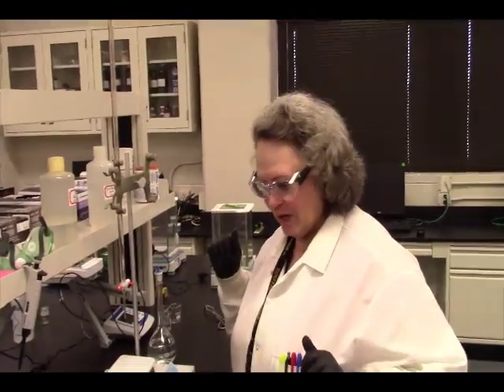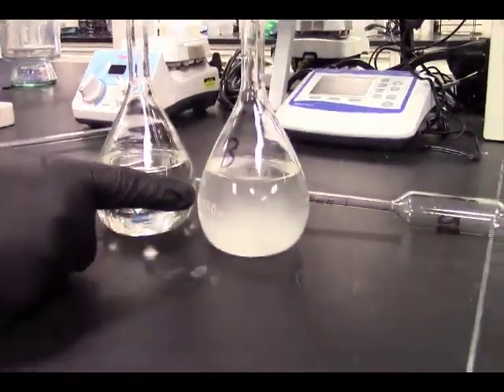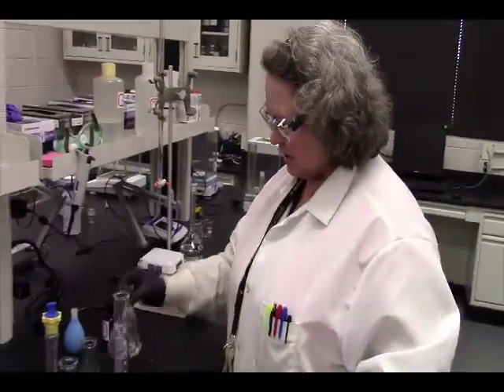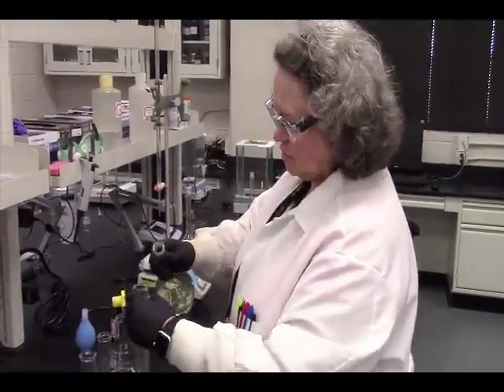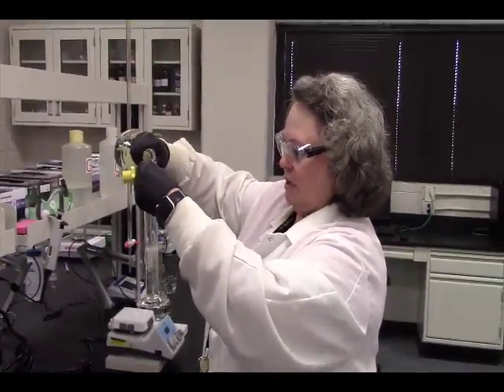All right, welcome back. We're here with our bleach samples. We have our generic and we have our brand name, which is Clorox. You can see over here in our stock solutions that the brand name is not actually clear where the generic is. You may want to hypothesize as to why that is. Okay. So we have 25 milliliters of our stock solution titrated in each of these. We're getting ready to add our 50 milliliters of our acidified KI solution. And then we're going to titrate just like we did. This should look very similar to our standardization.